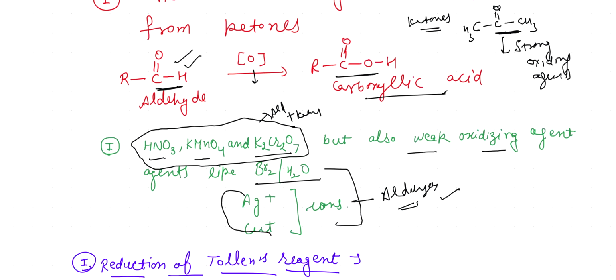Suppose you have two test tubes. In the first one there is an aldehyde group, and in the second one the group present is ketone. If your supervisor asks you how to distinguish these two, then you will perform two tests.